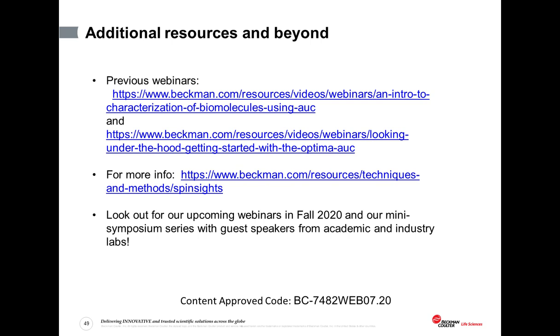Yeah, thank you. So another question is following up on something that you mentioned earlier in your presentation, where you were mentioning the importance of knowing the empty, partial, full ratio. They're just looking for a little bit more information on why it's so important to really focus on the full particles.